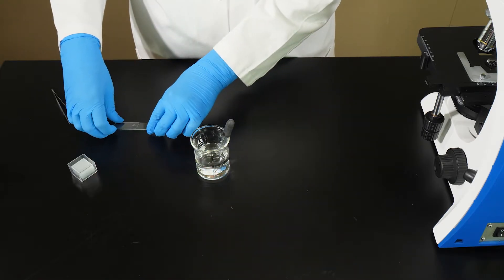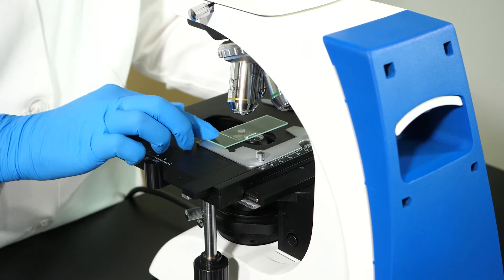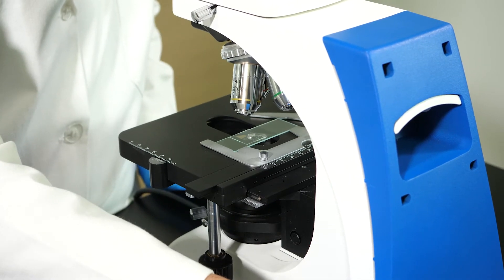Now, we are ready to view our specimen. We will follow the steps we practiced in the previous lab to position the slide and focus the image of the specimen. Under the scanning objective lens, our specimen looks like this. Watch now as we switch to the low power objective lens. At any higher magnification, the image would be hard to see clearly.